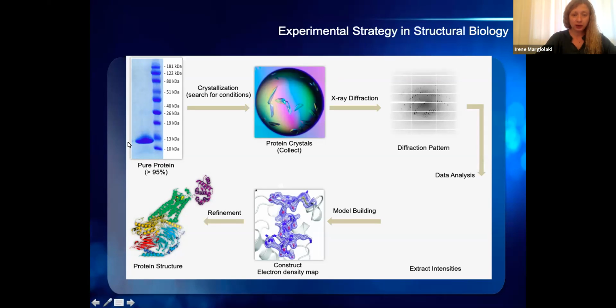And what you see here is an electrophoresis gel, which verifies that we isolated the specific protein we want to study. The solution has to be very pure, otherwise it doesn't usually crystallize. So after we isolate the protein, we crystallize it, and there is a lot of physical chemistry behind protein crystallization. That's why it developed into a separate scientific field, in fact. The most successful technique is single crystal X-ray diffraction, and it will always be.